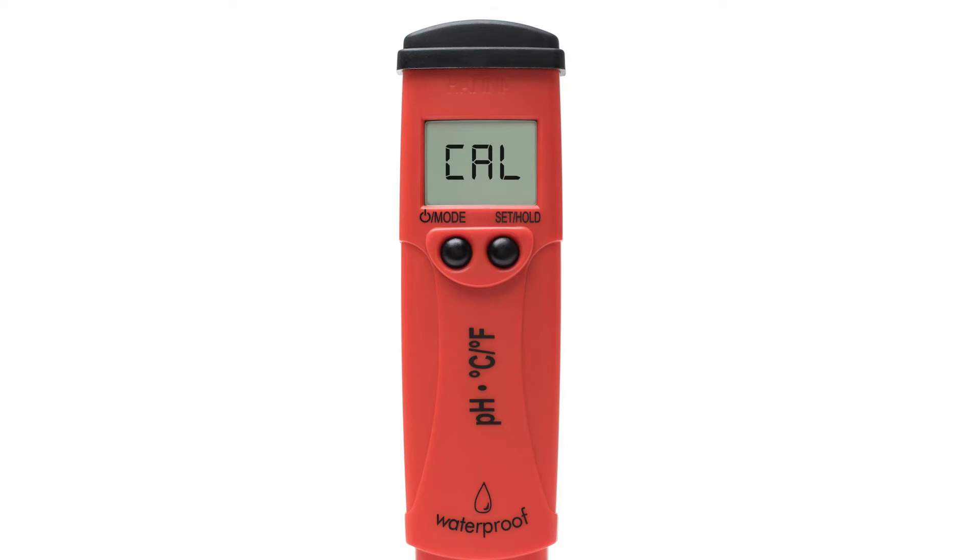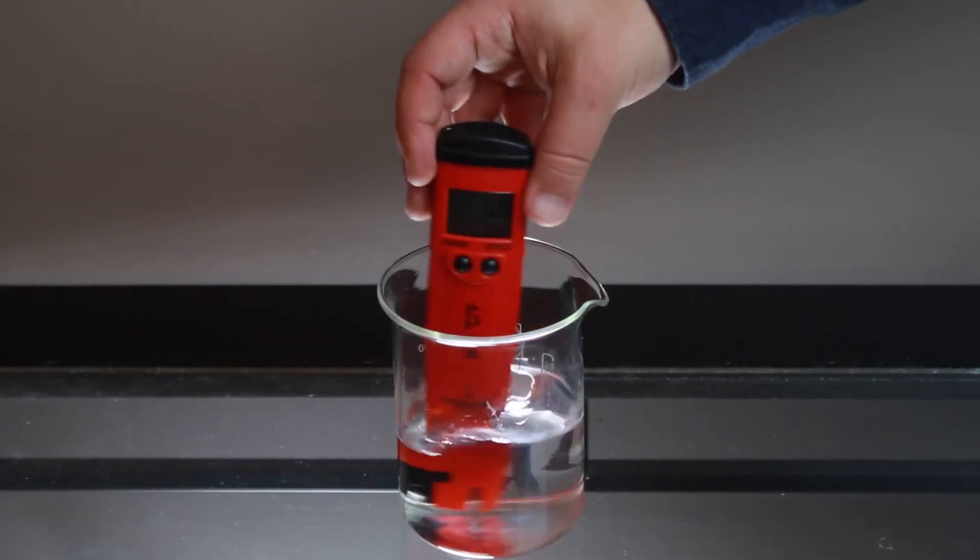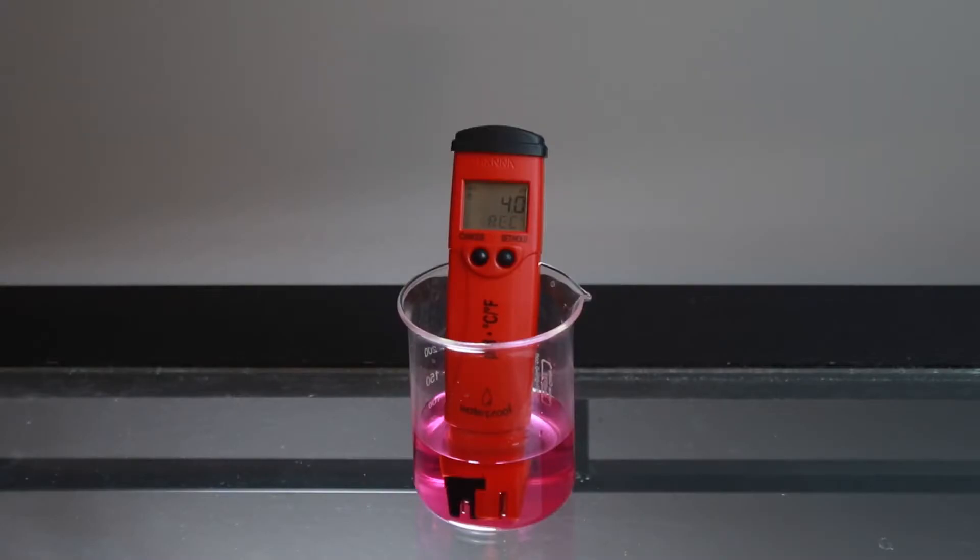We recommend a two-point calibration. Place your electrode in your HANA pH calibration buffer. Your pH tester automatically recognizes which buffer you use first. Once recognized, rinse the tester in distilled water, then place your tester in the next buffer. After it's complete, the meter will automatically return to measurement mode.